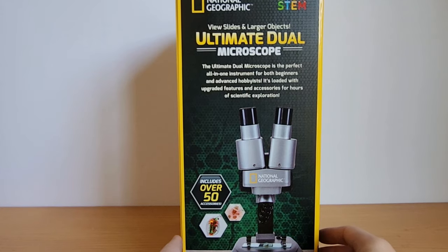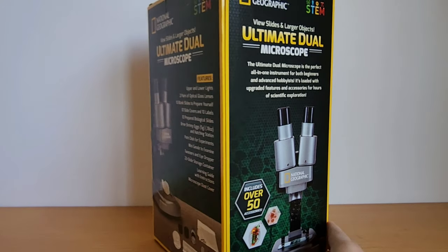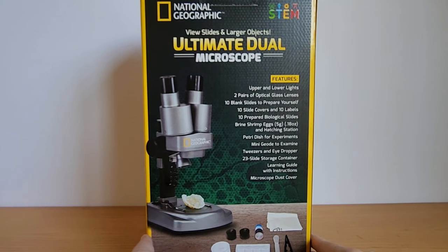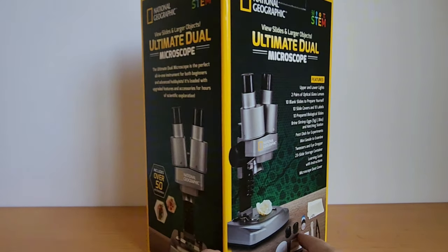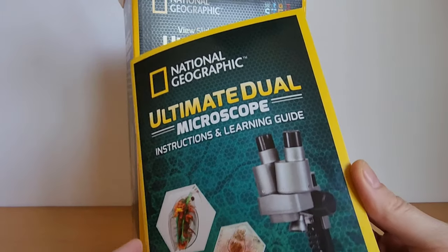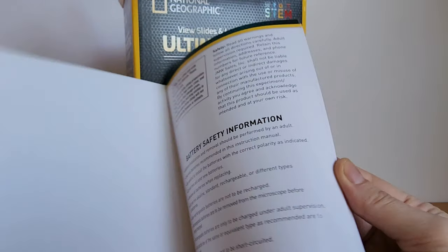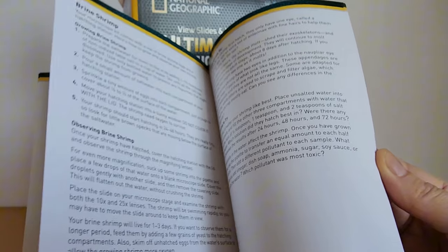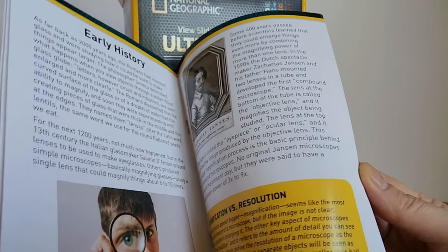We homeschool, so this was a really great microscope for my kids to start off being able to just look at all different kinds of things up close. My youngest son, when he started looking at different objects in the microscope, said, "Wow, this is amazing. I just want to look at this all day long because it's so much fun."